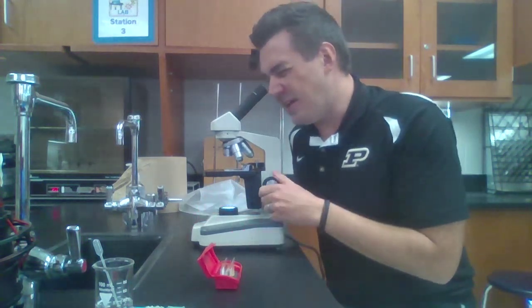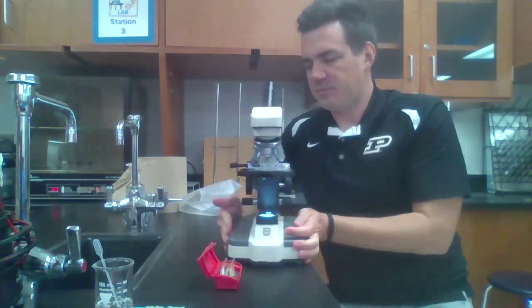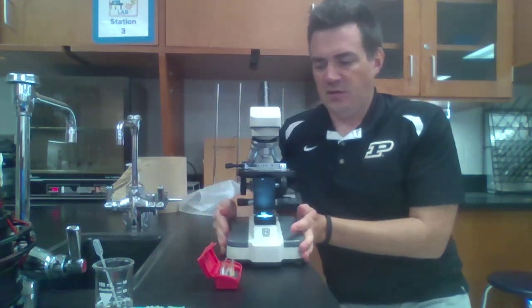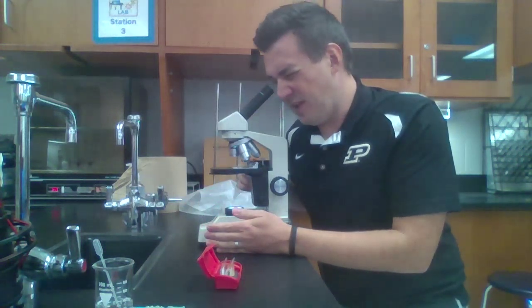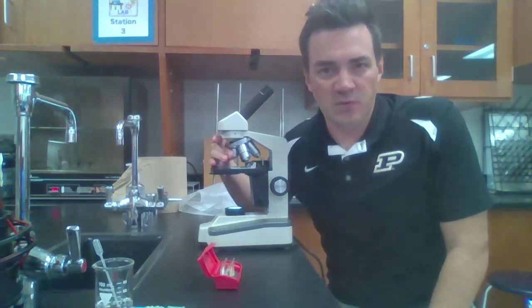So, I'm going to get that into focus on low power, and then on this side, over here, there are two little knobs that are going to be able to move the slide around on the stage as long as you got that clamped in there properly. So use these to move it left and right or up and down, and you can use that to scan around and find the hair that you're looking for. Once you've got that in focus, then you're good to move up to a higher power.